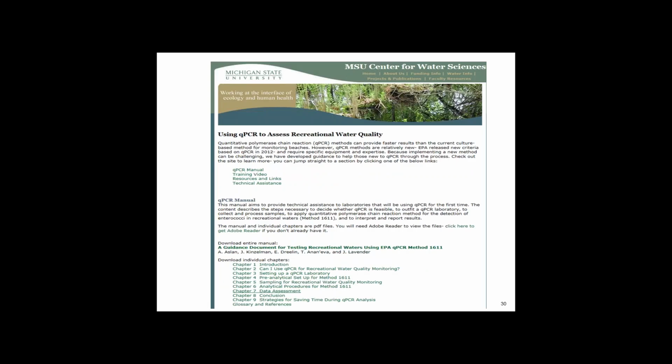MDEQ and MSU work together to develop training materials on how to use the rapid method QPCR. They develop training manuals and a video so beach managers can pop that in and learn how to use QPCR. It's not that simple, but it's a really excellent tool.